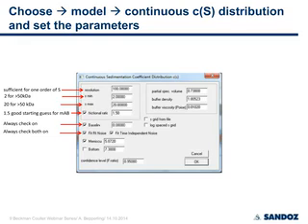You also want to fit the meniscus and let it float because it's correlated to the frictional ratio. I do not like it, although it's published, to fix the meniscus graphically and let only the frictional ratio float, because both of them correlate highly together. So when you fix the meniscus, you force the frictional ratio to maybe an unrealistic value. Therefore, you don't want to do that, and float both.